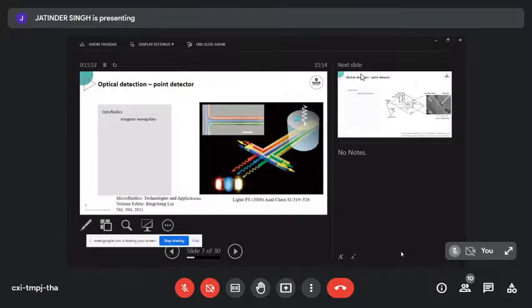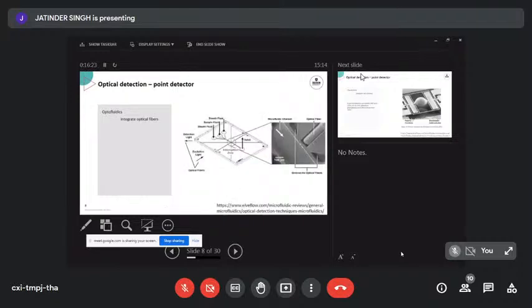And here you can see the light coming in. They've got liquids in here with different refractive indices, which means that we can get the different wavelengths out as well. So there's been a fair bit of work going on with combining optics and microfluidics, up to the point that we've got now a whole new research field that's called optofluidics. That's people that like combining fluidic channels with optical components.